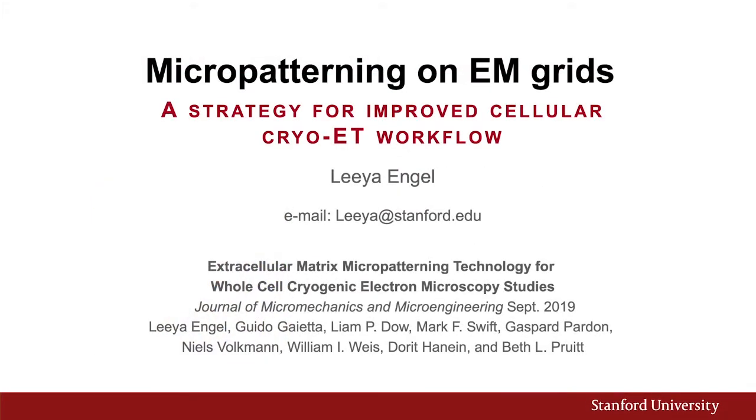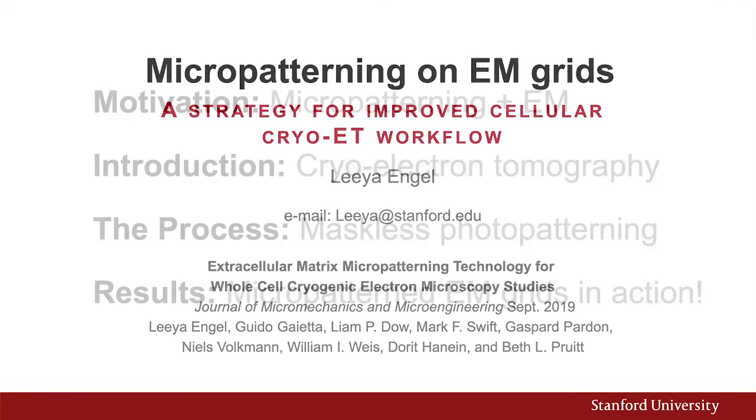Thanks, Jay. In this talk, I'll describe how to micropattern electron microscopy grids, a strategy that has improved our workflow for cryo-electron tomography of cells. Further details on the results that I present can be found in our recently published paper, Extracellular Matrix Micropatterning Technology for Whole Cell Cryogenic Electron Microscopy Studies.